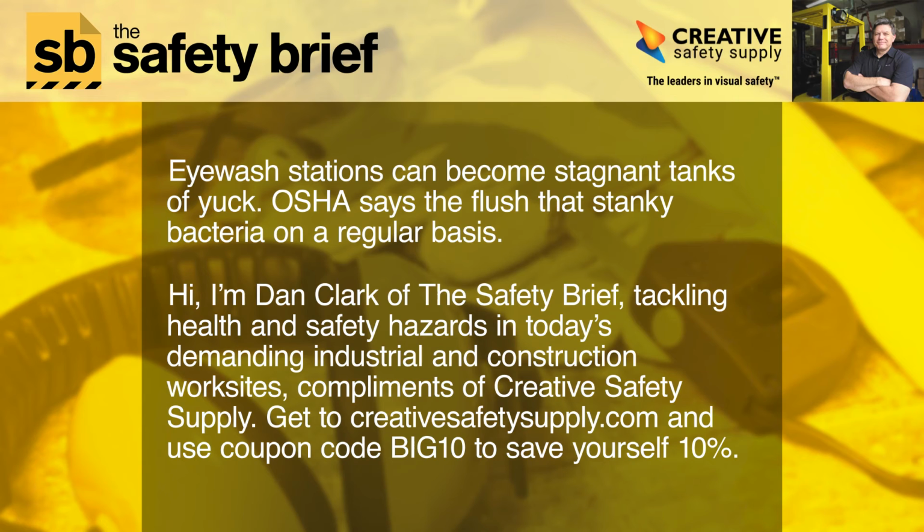Eyewash stations can become stagnant tanks of yuck. OSHA says to flush that stanky bacteria on a regular basis.